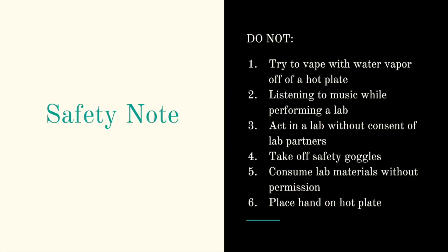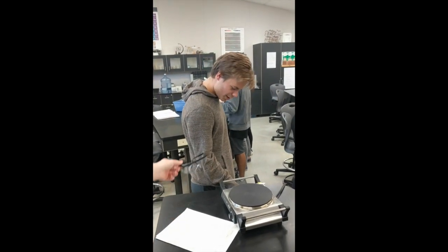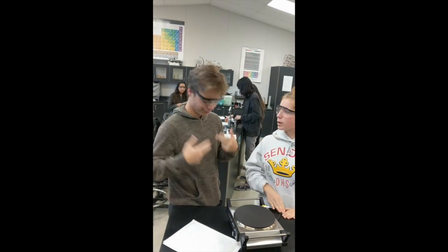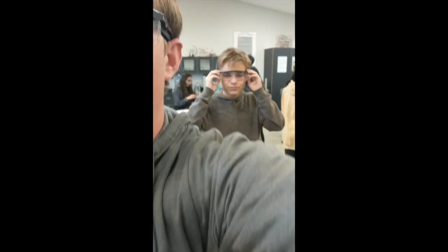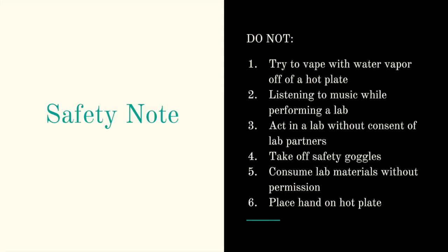4. Take off any safety goggles. He doesn't have his eye protection on. Always make sure to. Oh, it's not C more. Or is it D? Safety, number 1 priority. Must have. Being called.